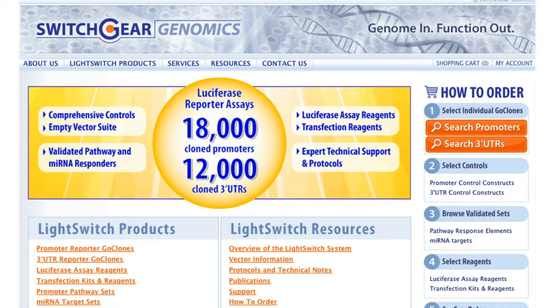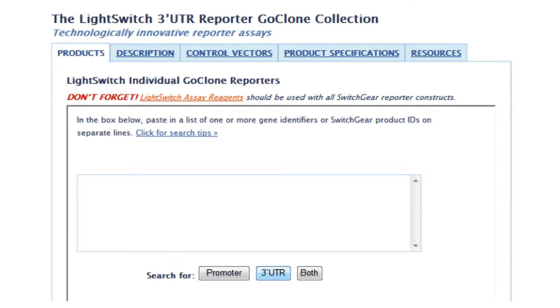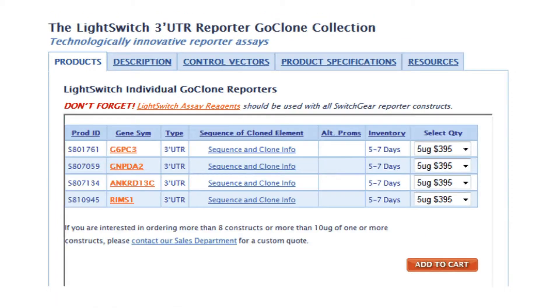Next, select the pre-cloned 3' UTR go-clone reporter constructs from Switchgear's genome-wide collection. Go to the online catalog and click on the UTR search button after entering the list of gene names, gene symbols, or accession numbers. The search result will provide vector and sequence information along with inventory status.